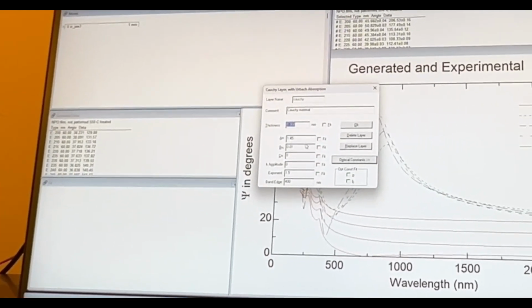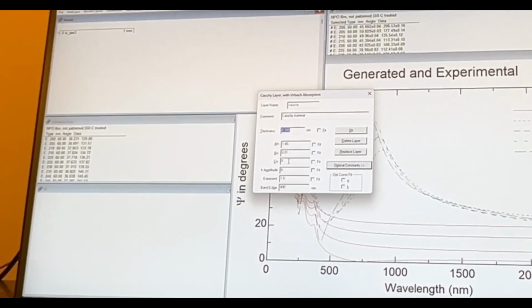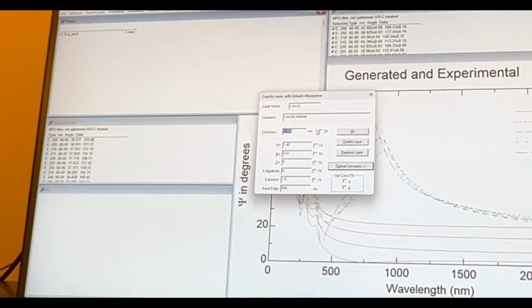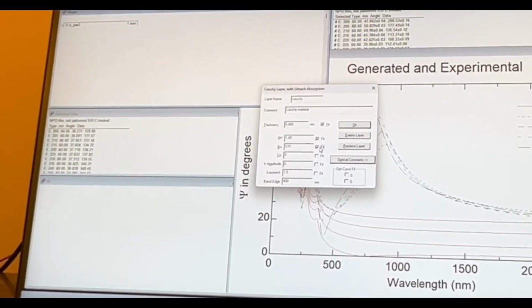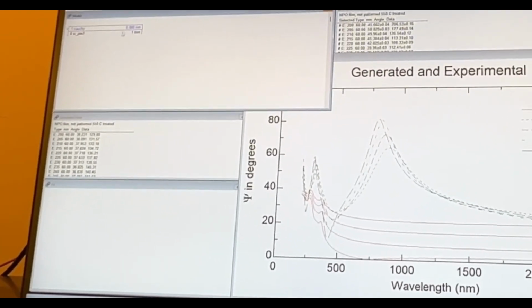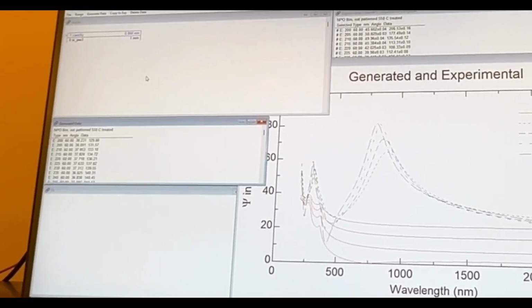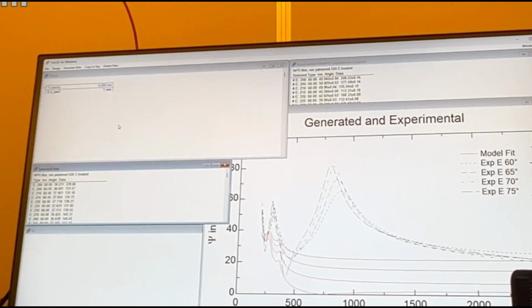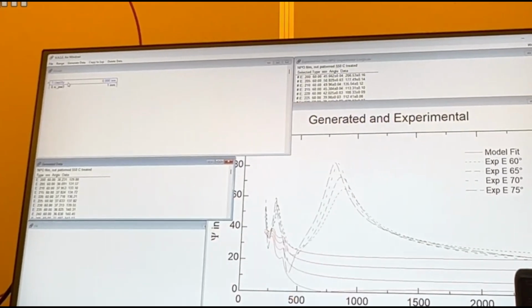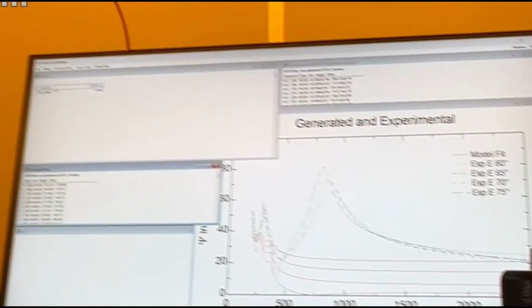Essentially you need to see if you have a wide enough spectral range or high enough dispersion. But for now, just for fun, we're going to allow these to fit eventually, at least probably A, B, and C. But I'm going to say okay. At the moment, since there's zero thickness, I could generate and nothing's different, because it's in the model but not being accounted for yet. Right now, the starting optical properties for the Cauchy are somewhat similar to SiO2, so index around 1.45, and we can start with that.